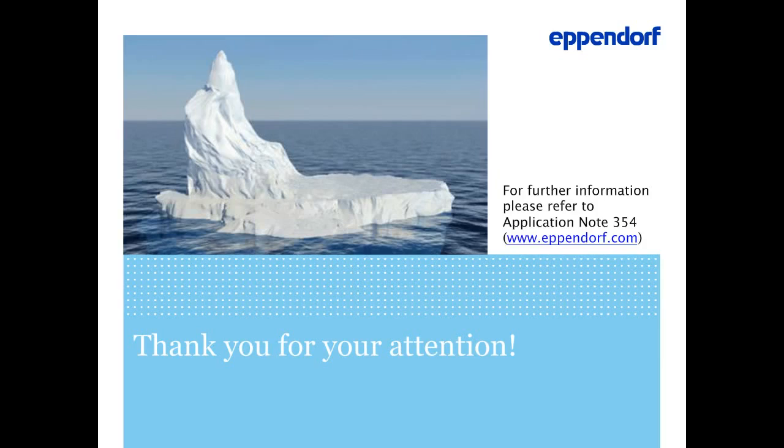We recommend doing this according to ISO 8655. In the first step, you do a performance testing using the original tips. This is a full calibration with 10 measurements, each at 3 volumes. First the nominal volume, then the 50% of nominal volume, and 10% of the nominal volume. On our website, we offer a standard operating procedure for further instructions on how to calibrate the system of Eppendorf pipettes and tips. If the system is working within the manufacturer error limit for inaccuracy and imprecision, you proceed to step 2.